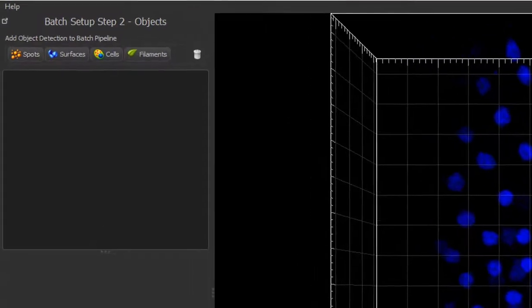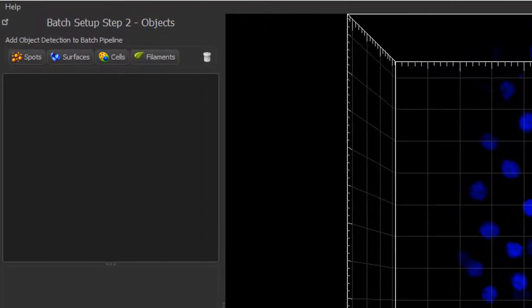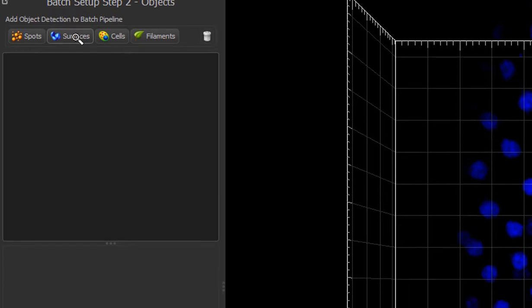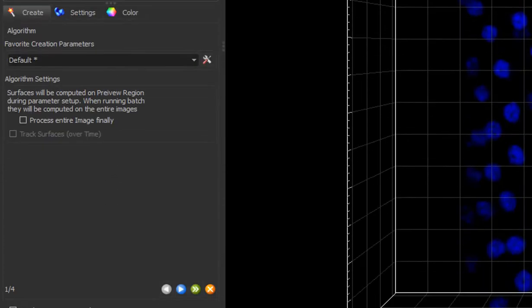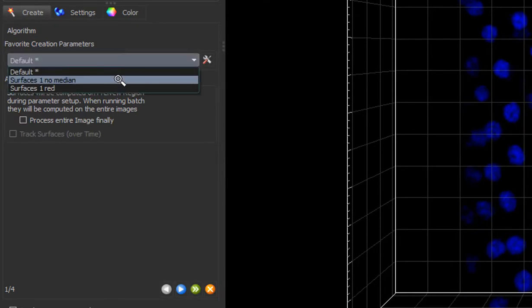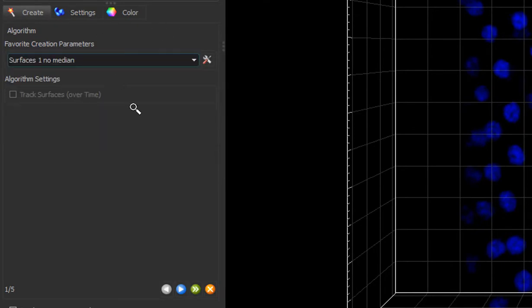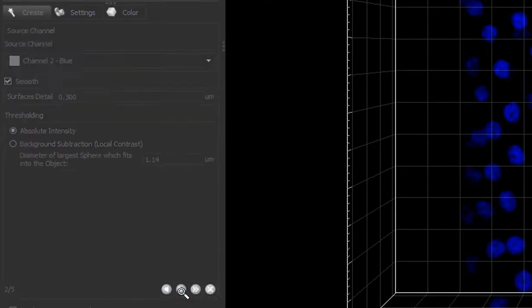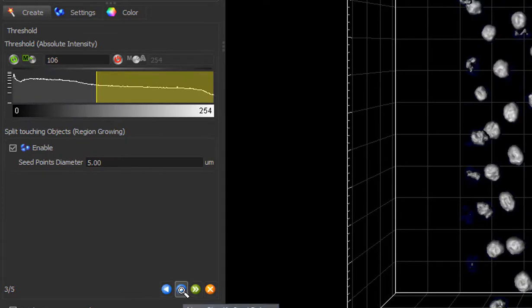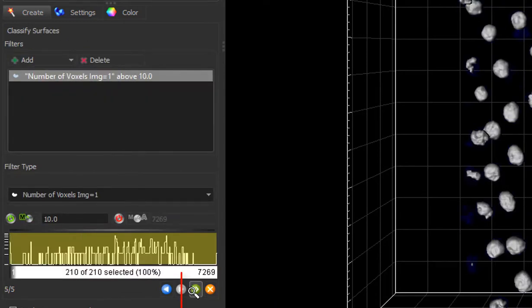I want to detect one object, surfaces in blue channel. And again, you can add as many objects as you want. Add surfaces. Proceed with the surfaces creation wizard steps. Here I used predefined parameters and finished the wizard with the finish button, double green arrow.